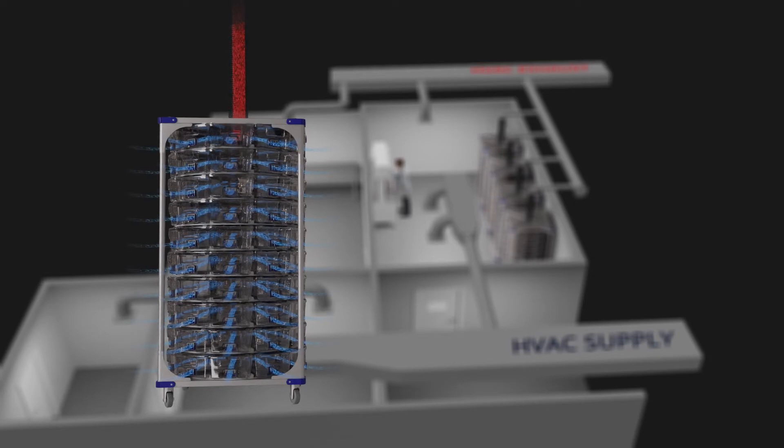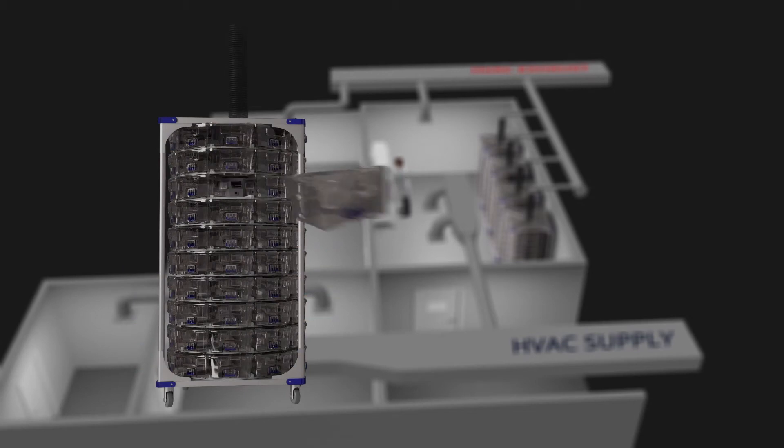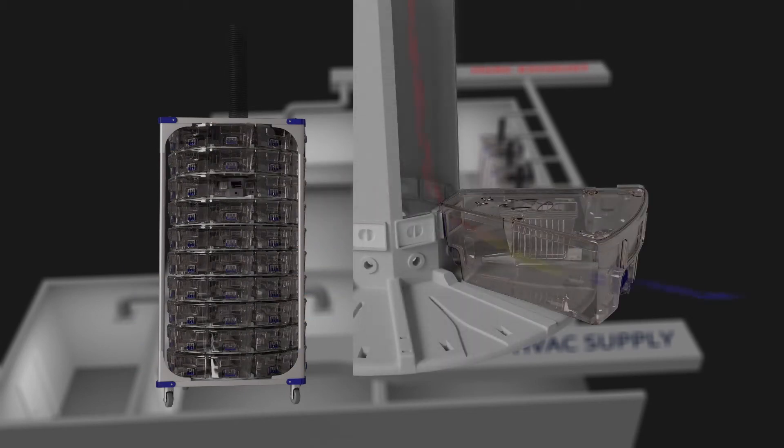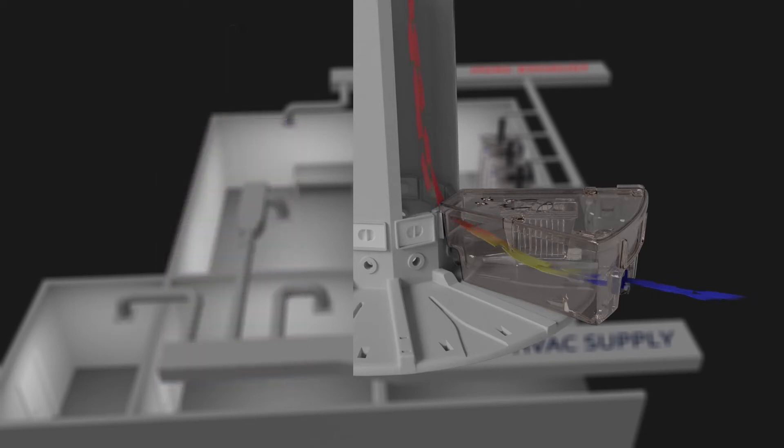In the room, the room air travels through the filtered front of each cage and then travels through the cage in a laminar, slow, and thorough manner, taking all the allergens, odor, and infectious agents with it, where it then exits through the back of the cage into the rack's central plenum.